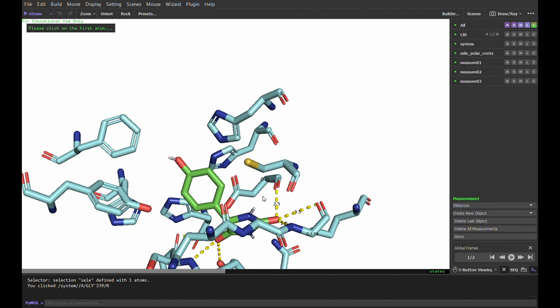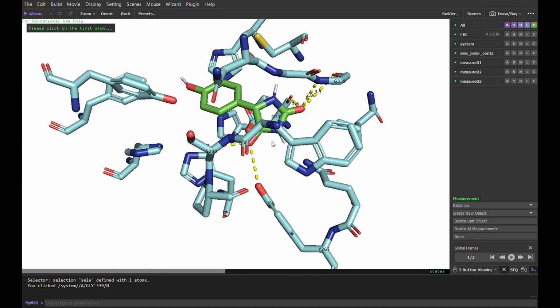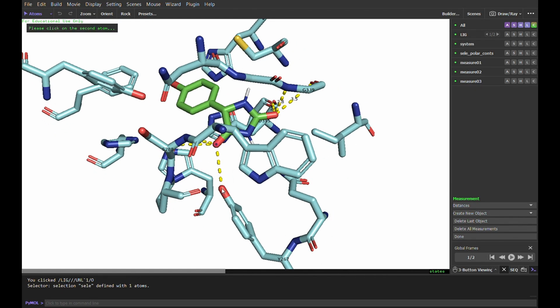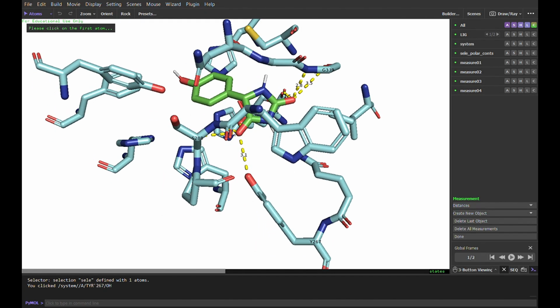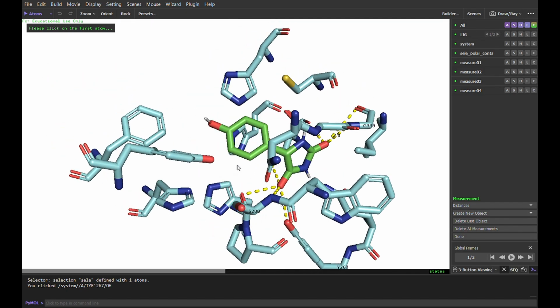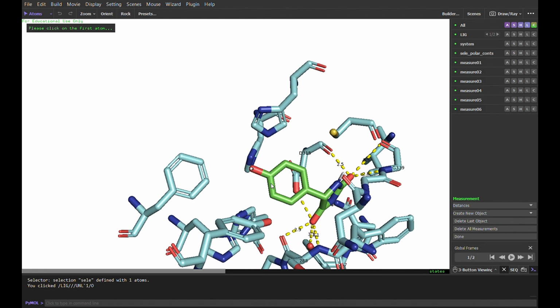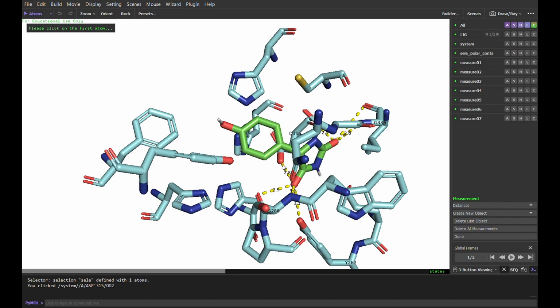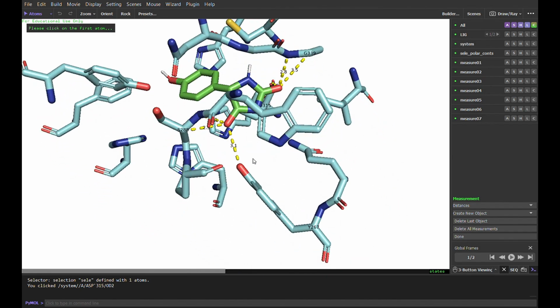Bonds are electrons. It's just one donating and the other receiving or sharing of electrons. So there should be a donor and a receiver, or in any bond, just sharing of cloud from one interaction. So this is very important. Bond length is important. So here I'm trying to measure the bond length. I think it's done now.